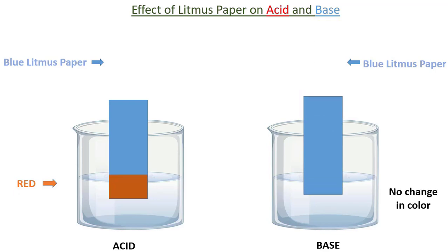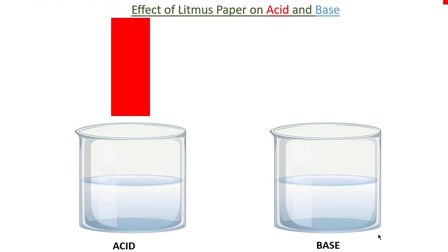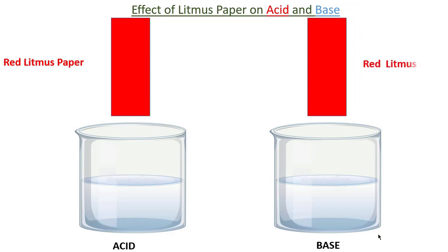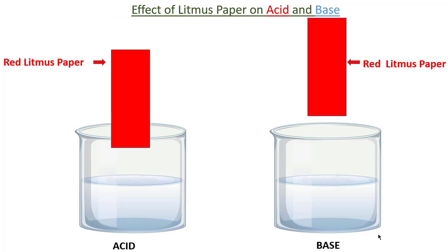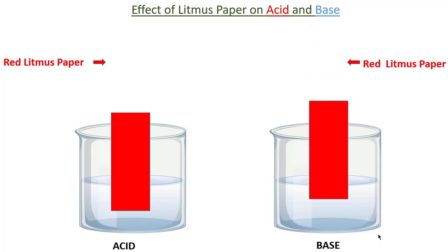Now let us consider the red litmus paper. We have two beakers containing acid and base solutions. When we dip the red litmus paper into the acid solution, there is no change in color. Similarly, when you dip the red litmus paper in the base solution, it changes into blue color.